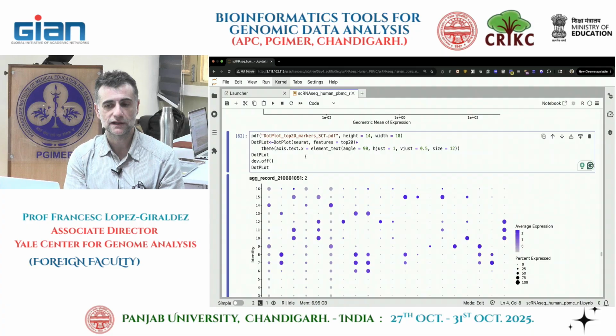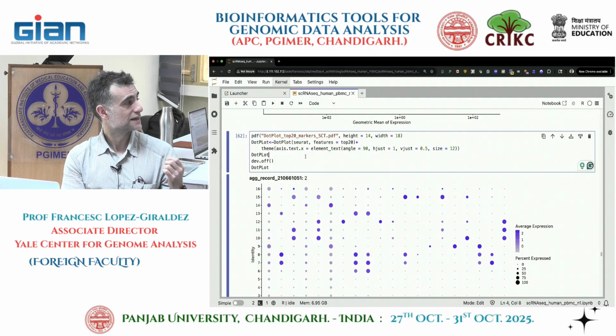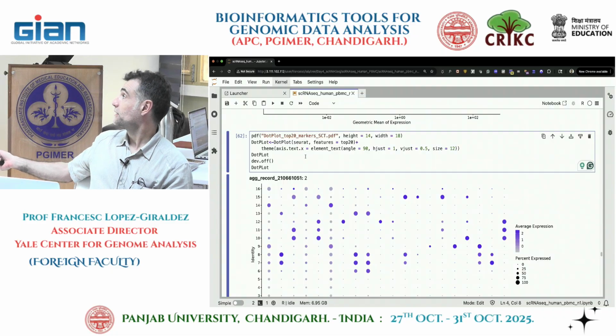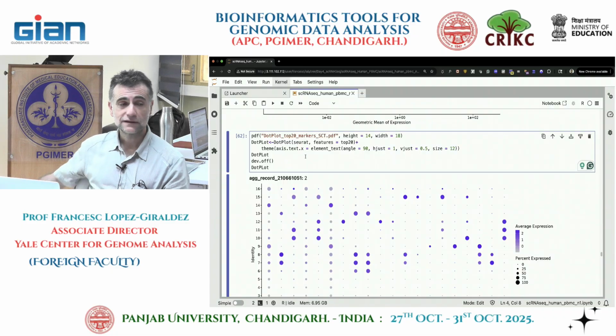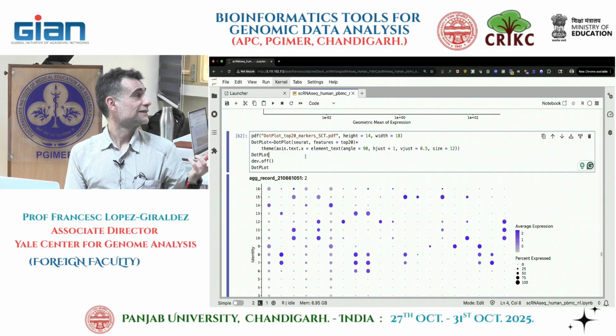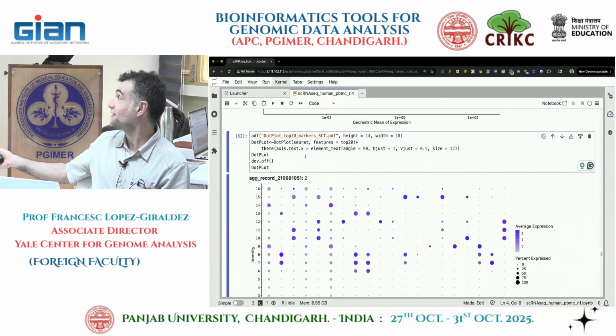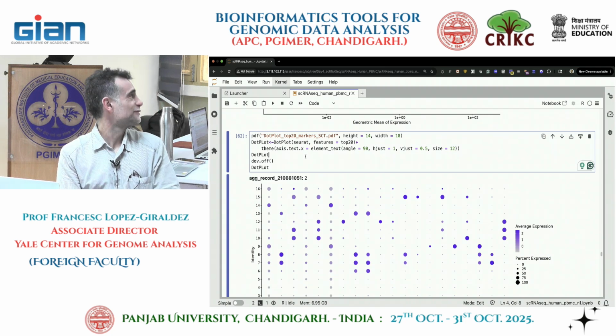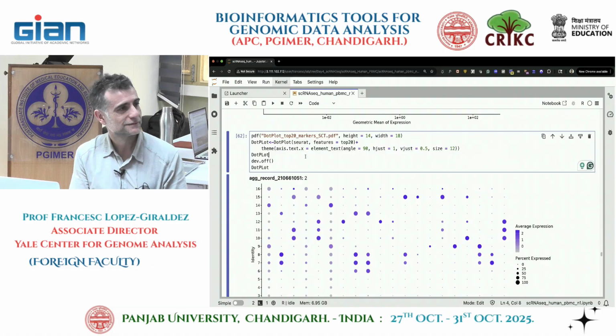Oh, what I was explaining. So remember our assay is SCT, is the one that is active. What I was saying is they call it average expression, right? For me, it's hard to imagine. We transform so much the data that, yes, it's expression, but it's transformed. I would call it SCT transform average expression if you want to. I don't know how to call it. The units, it's hard to tell what unit we're using here.